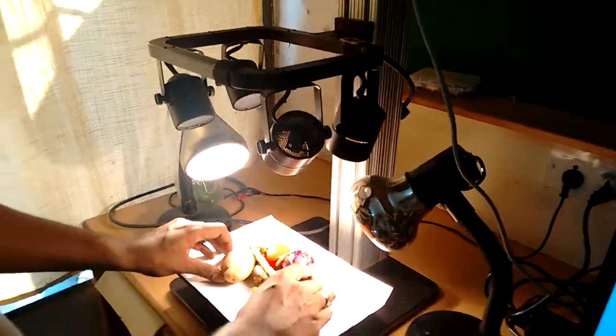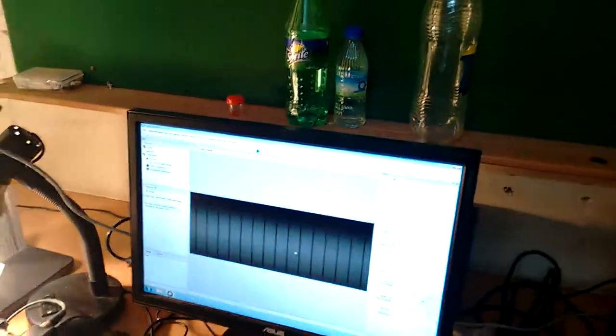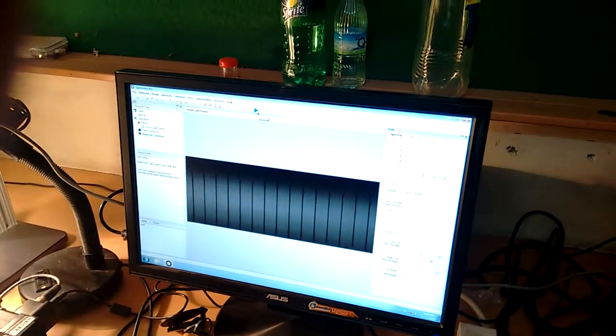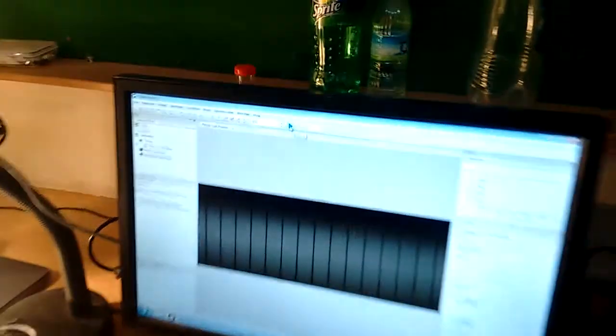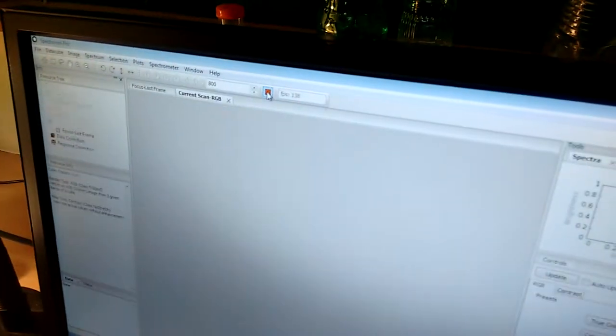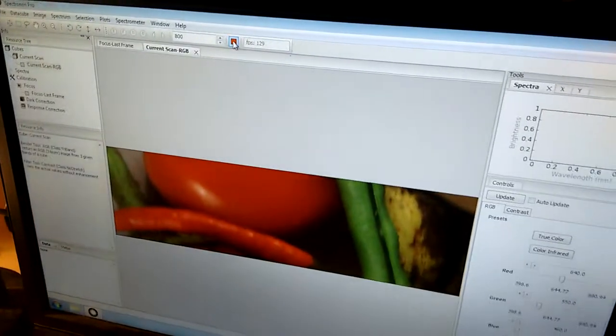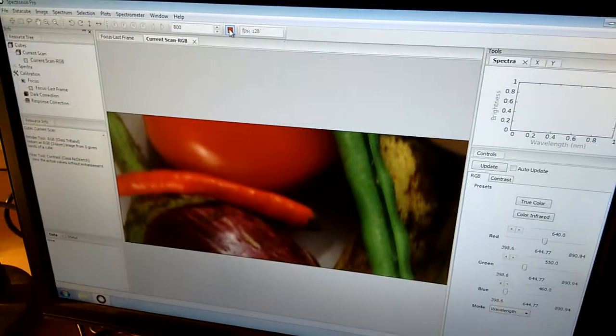So ready for measurement? Yeah, I say record. It's building the image.